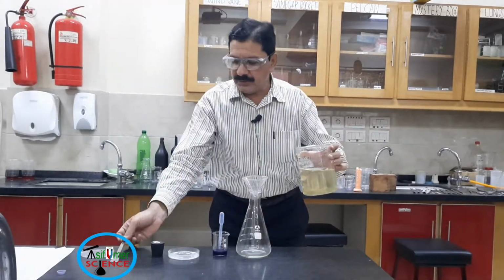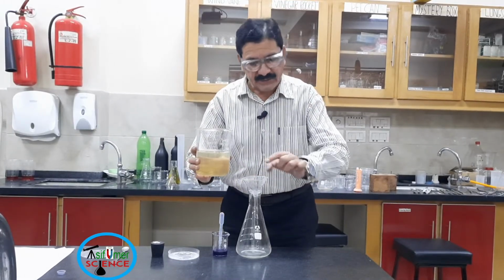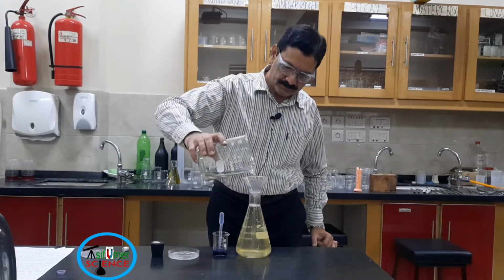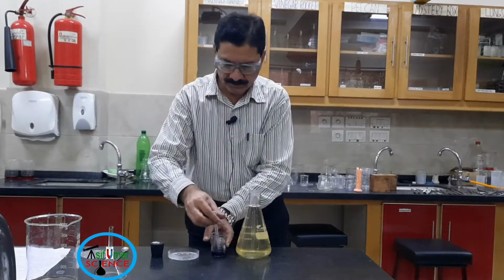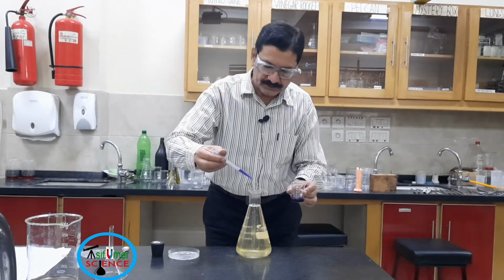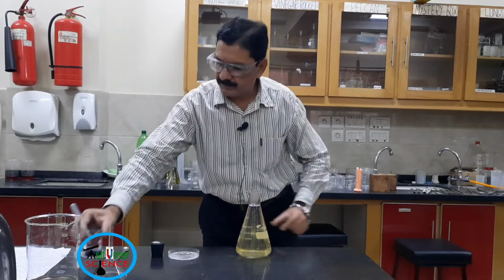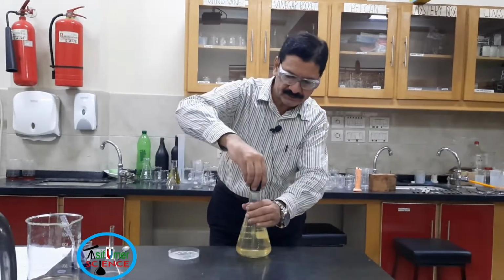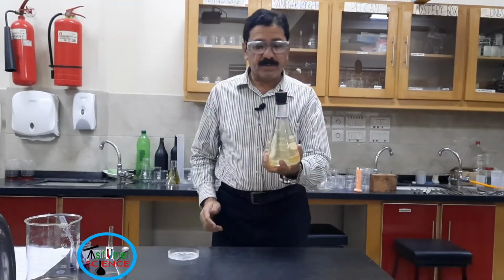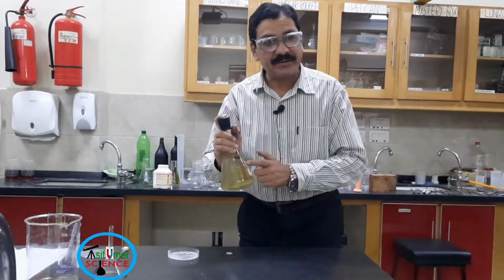Now I am going to pour all the solution in a conical flask with the help of a glass funnel. Going to add a few drops of methylene blue. Inserting the cork. Our blue bottle solution is ready. Don't try this activity at home.